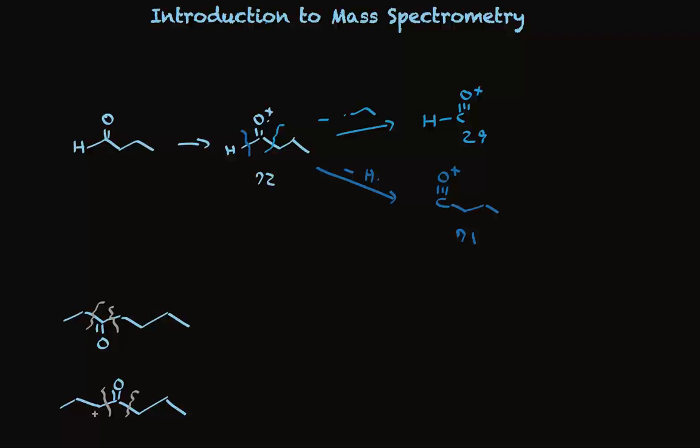In this case, both fragmentations would give the molecular weight of a single fragment. In this case, there would be two different molecular weights, easy to predict, because this is an unsymmetrical ketone. Mass spectrometry, an extremely powerful tool for identifying organic structures.